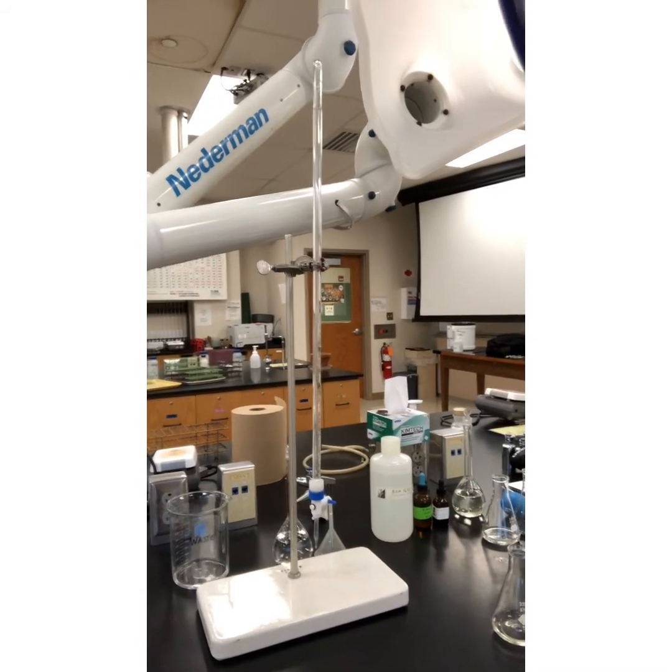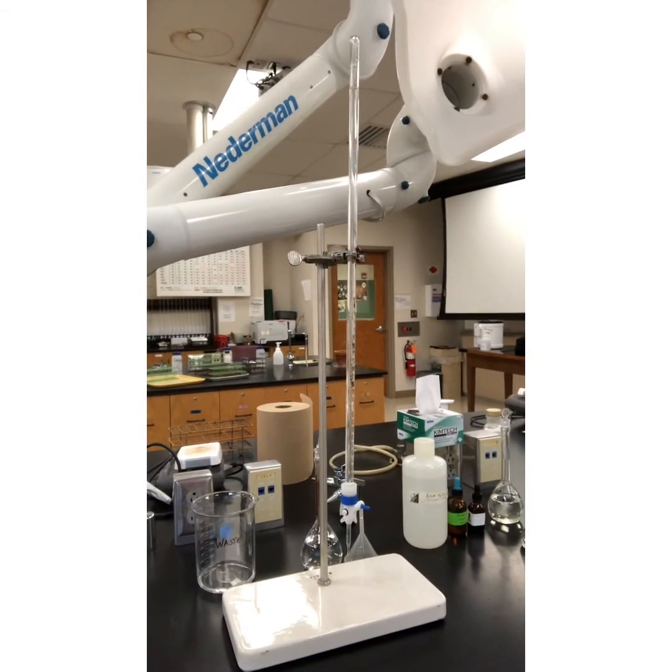Then we have an equivalence point, right? We can use that equivalence point to count the number of moles, to figure out the mole ratio, and choose which one of these equations for the grading of the lab is what's actually happening, what the actual mole ratios are for this particular reaction.